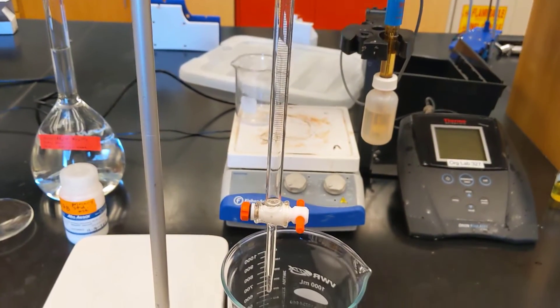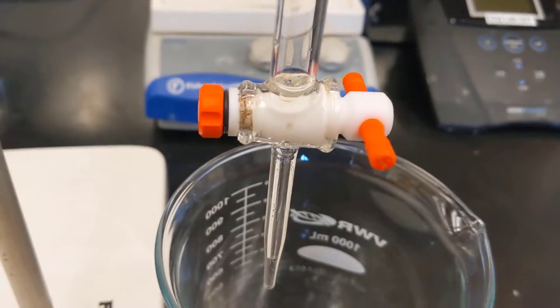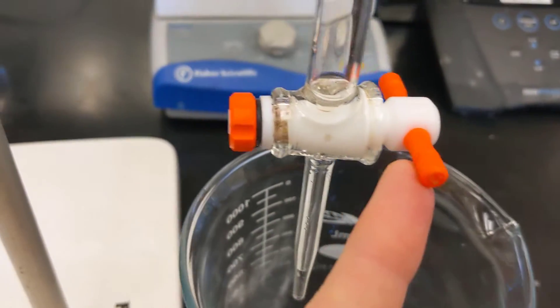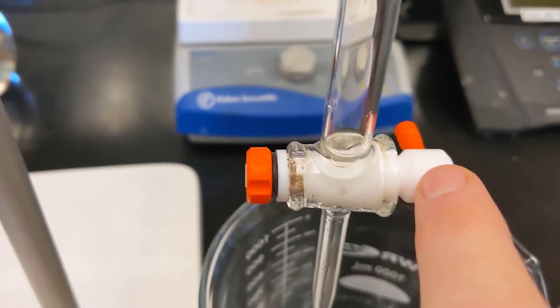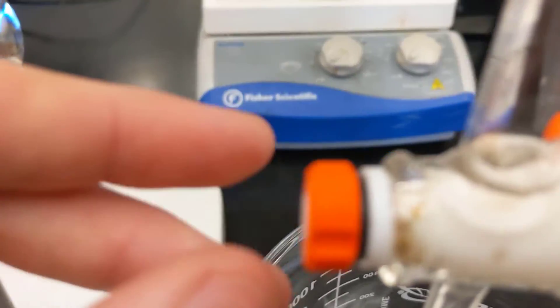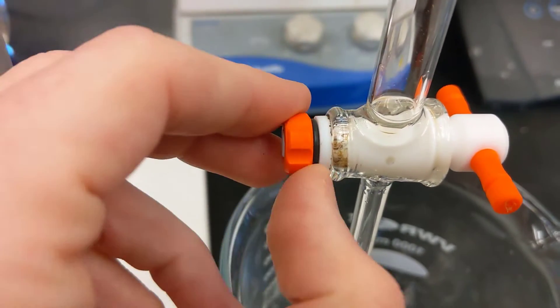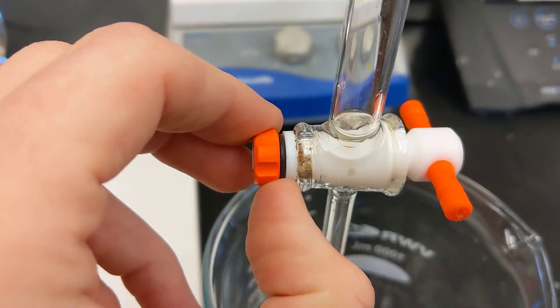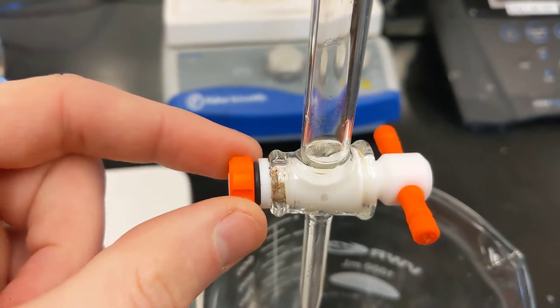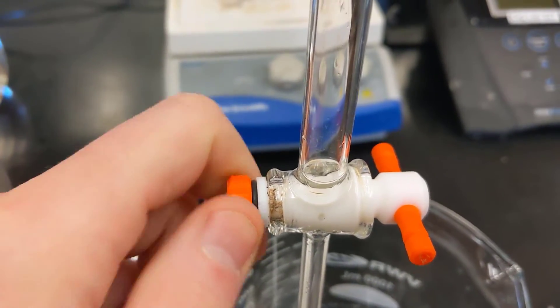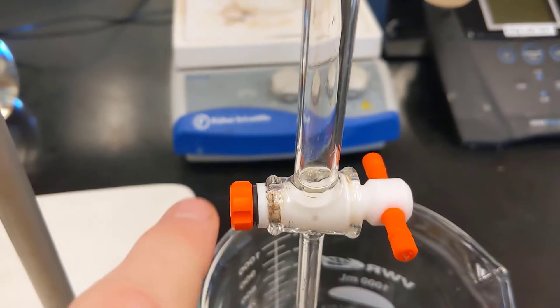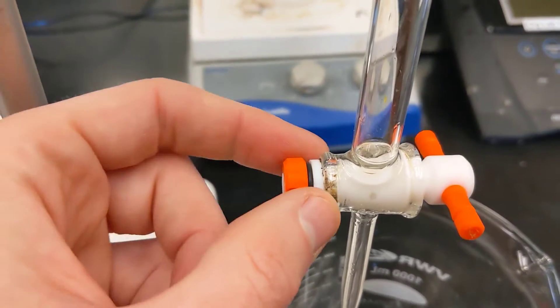And then you want to make sure to inspect your stopcock, make sure it's assembled correctly. So you can see the Teflon stopcock. There's nothing on this right side. It gets pushed through. And then on this other side, there is a Teflon washer, which is that first white band. Then you have the O-ring, and then you have this lock nut. So if I were to unscrew this lock nut, this would come out as an assembly of several different parts. So you just want to make sure it's assembled correctly.